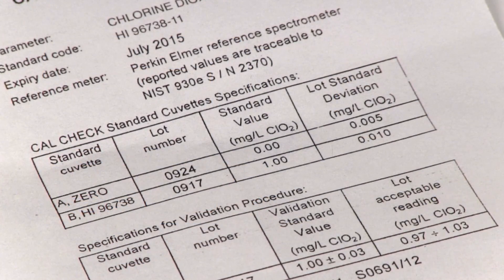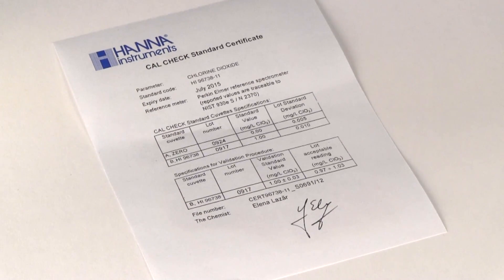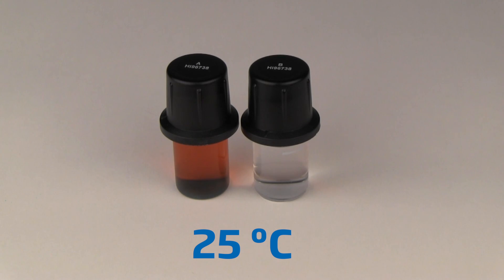CalCheck standards are certified at 25 degrees Celsius, and as the temperature varies, so will our obtained value. The further the temperature of the cal check standard is from 25 degrees Celsius, the less accurate the calibration check standards become. When performing a calibration check, care should be taken to ensure the standards are as close to 25 degrees Celsius as possible.